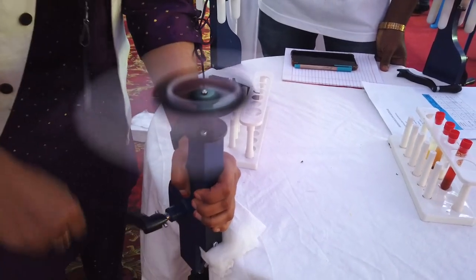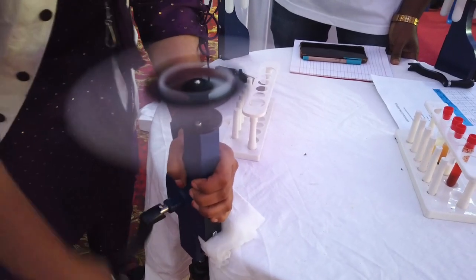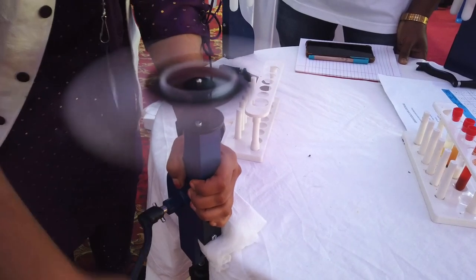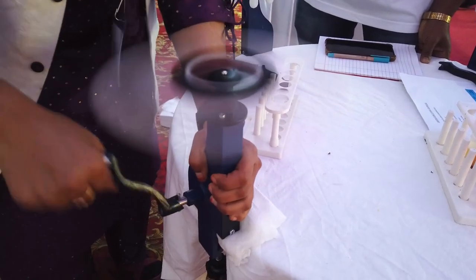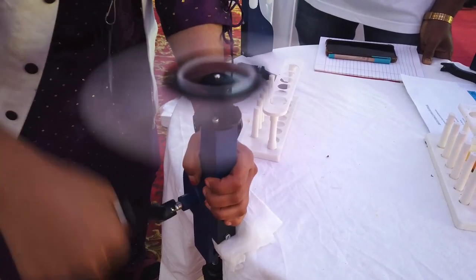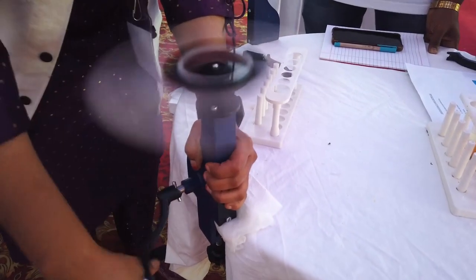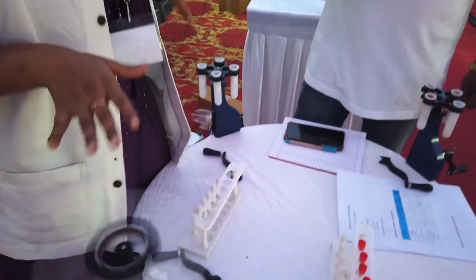You have to rotate it for a certain period of time until the mixtures get separated. You can see the pellet, supernatant, and some layers. This is a very simple model, so you can separate simple mixtures. There are other centrifuge machines used to separate complex ones like blood, which need 15,000 rpm, but here the maximum is only 500 rpm.